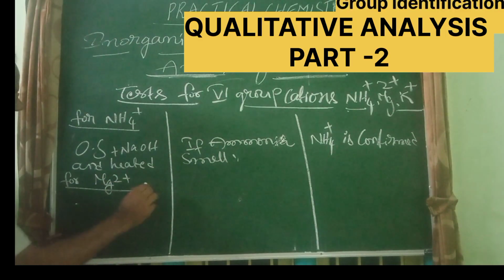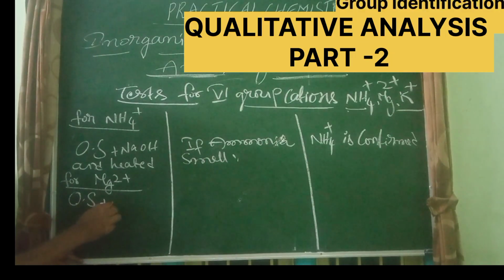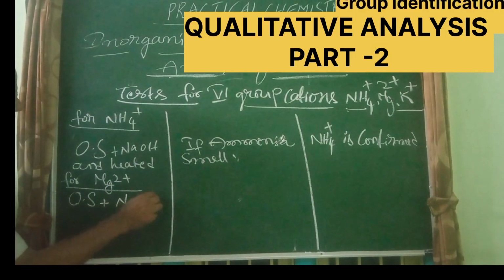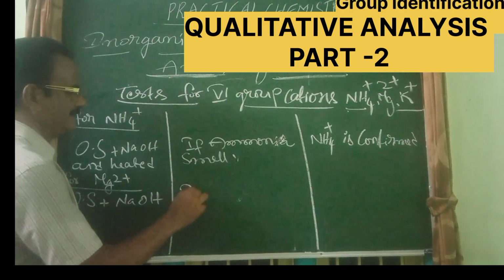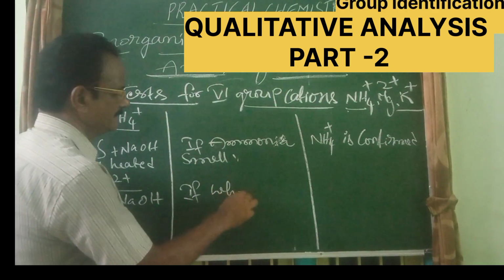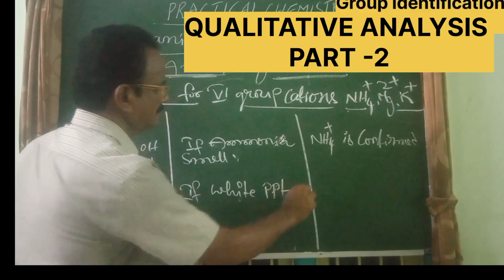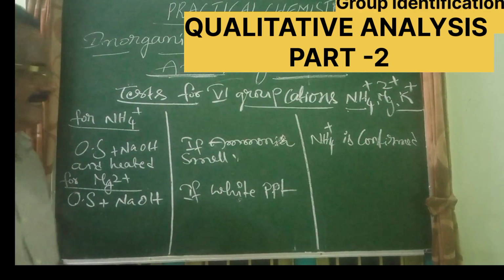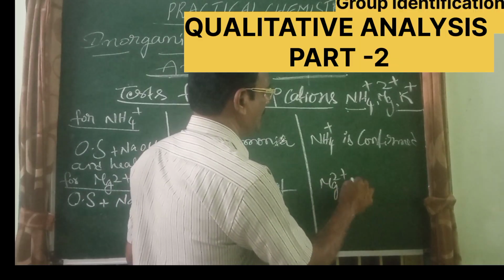For Mg2+, if you add NaOH to the original solution and there is a white precipitate, then you can confirm the presence of Mg2+.